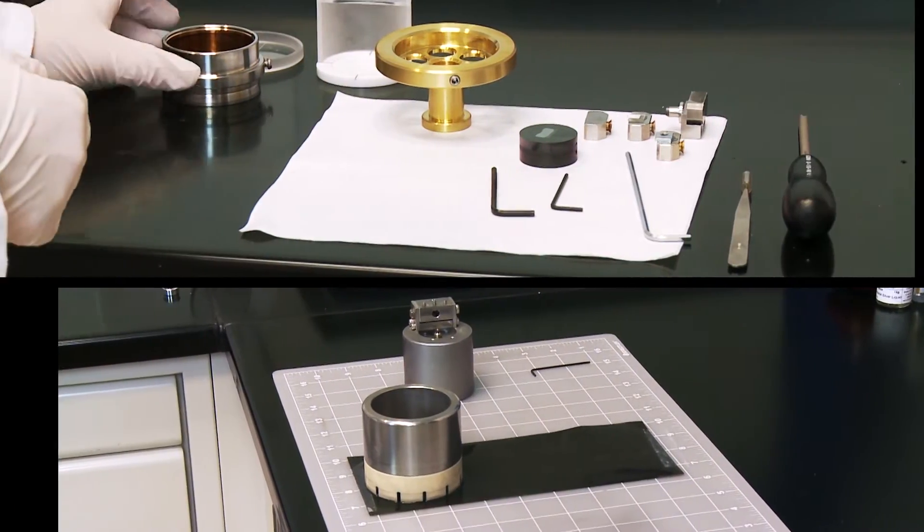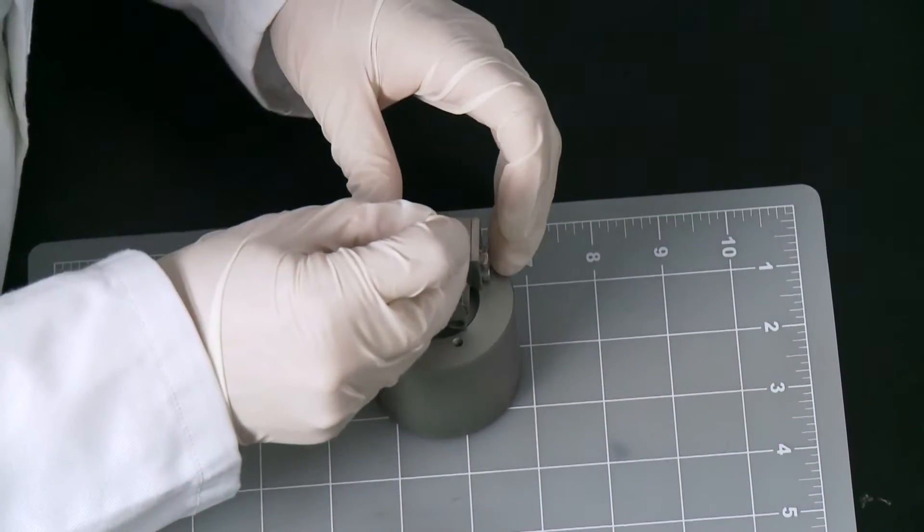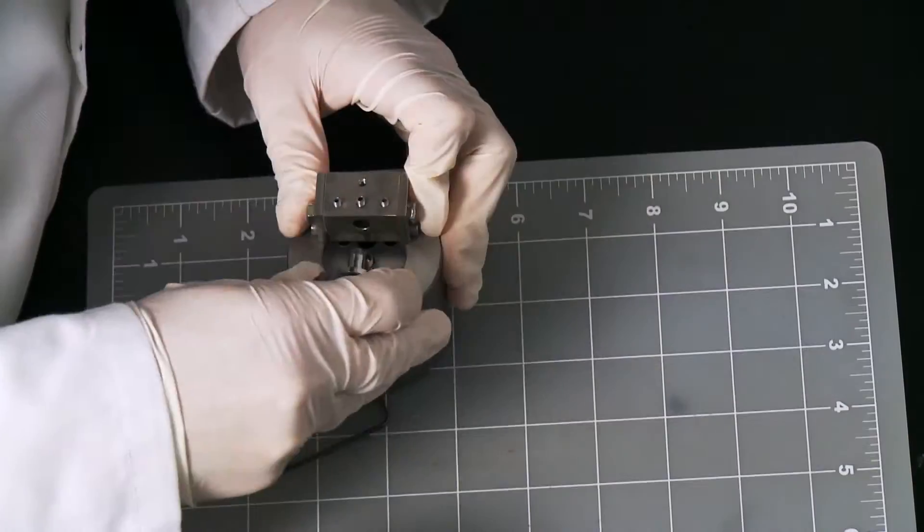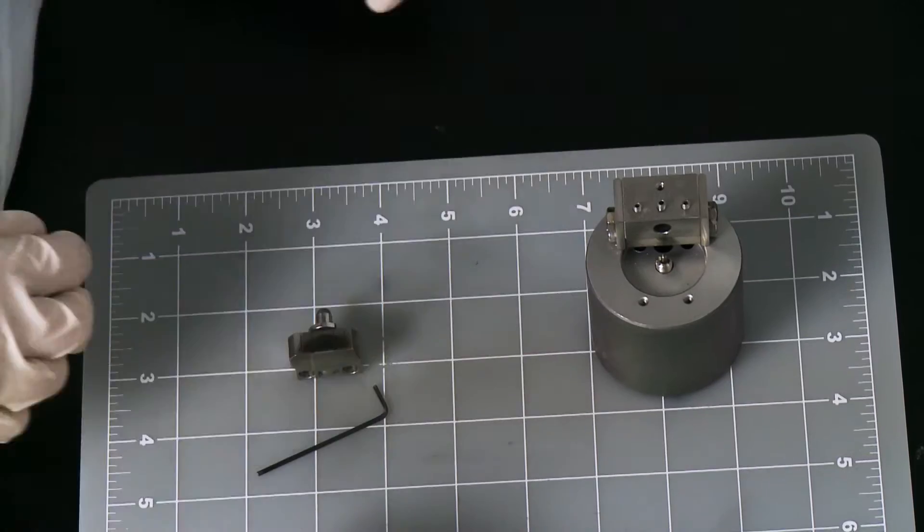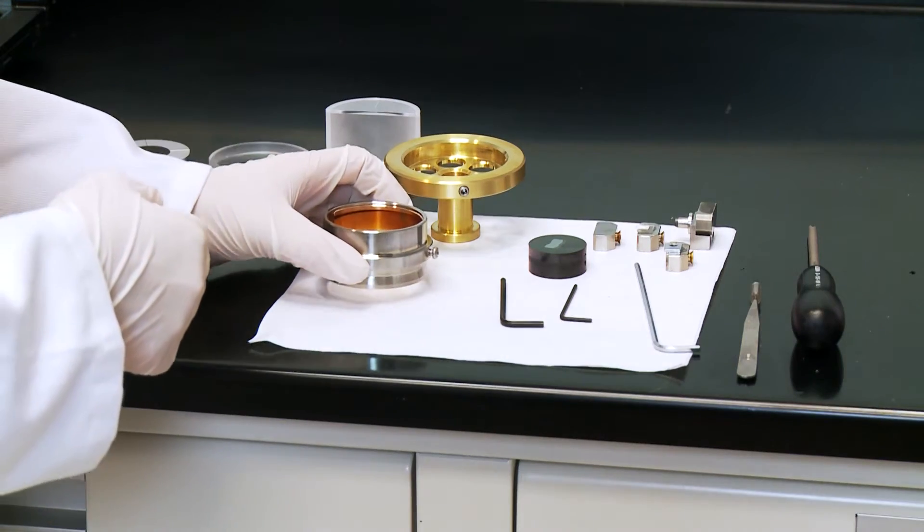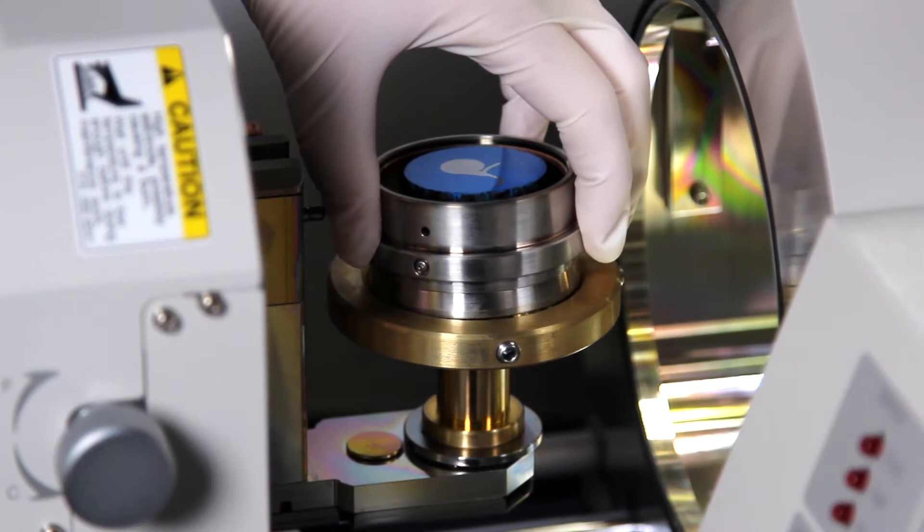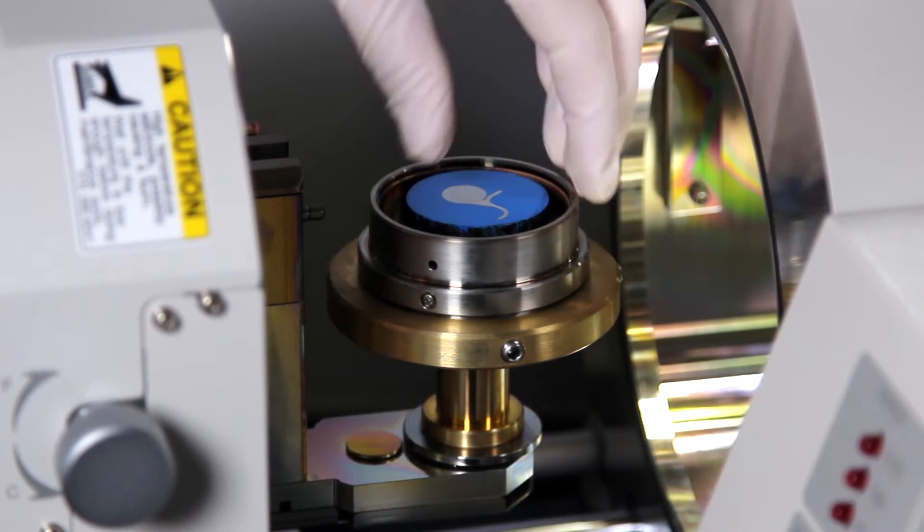Two milling configurations are available. Cross-section mode for milling below the surface for high resolution imaging of subsurface structures. Flat milling for uniform polishing of surfaces of more than 5 millimeter in diameter and with variable angle milling to selectively enhance specimen surface features.